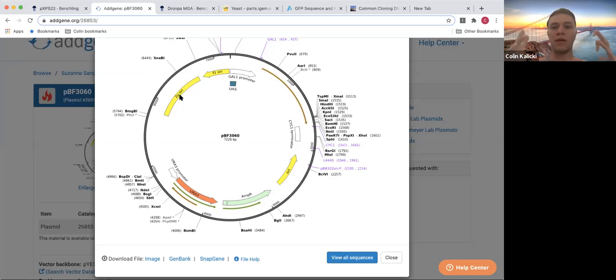So whenever you're making a plasmid, you want to make sure you have all the right starting points so the plasmid can actually be repeated. And make sure you really understand the thought process of what your experiment's going to look like. Starting in E. coli, transforming it to yeast once you get enough plasmids, and having the right machinery baked into your plasmid.